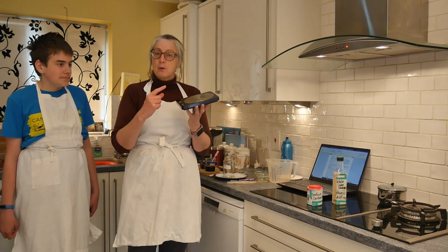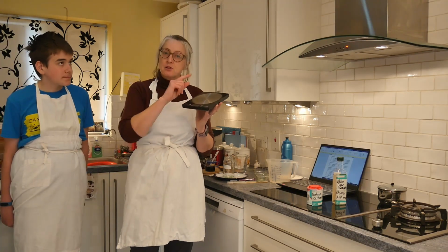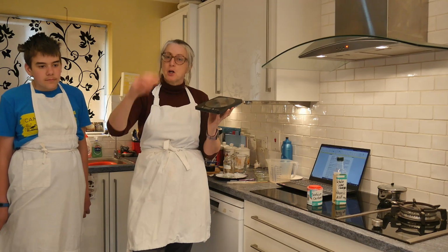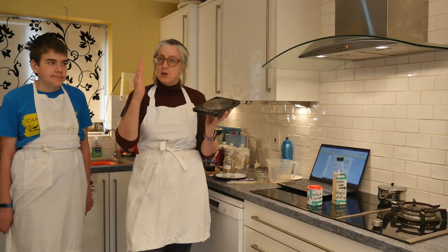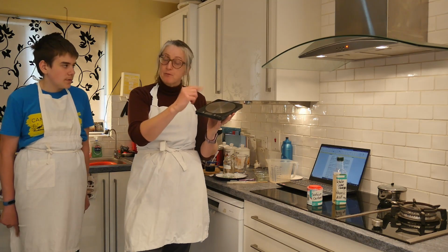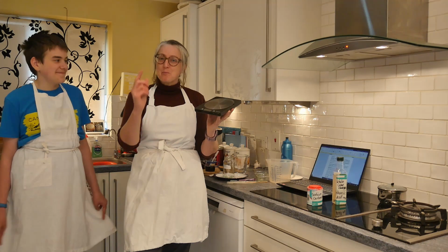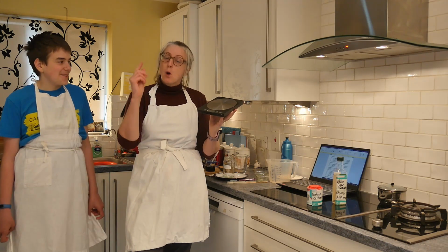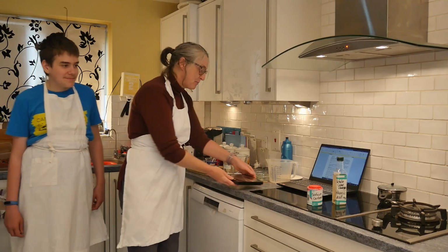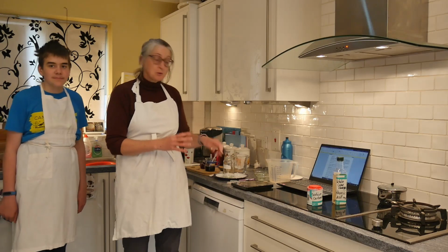Now the reason why we work with grams is because we're looking at metric, and it's got a complete metric unit calibration with volumes of liquid. So 1 milliliter of liquid is the same as, this is of water particularly, obviously not mercury, 1 milliliter of water weighs 1 gram. Okay, so that's important. If you can get electronic scales, that's really good, all to the better.